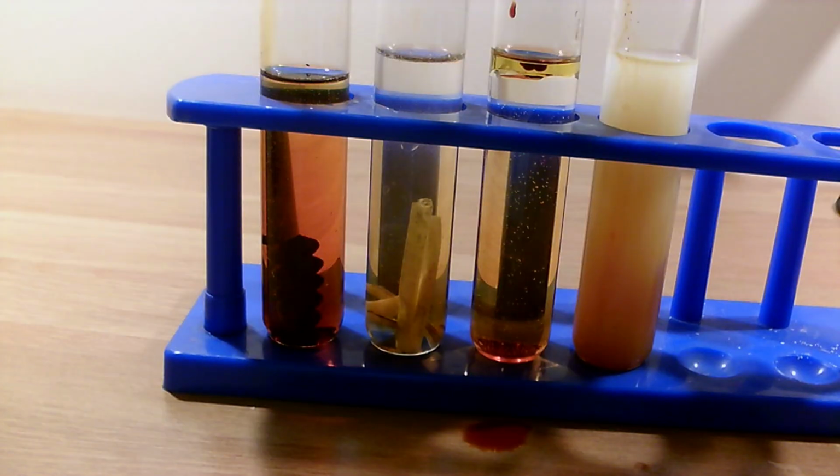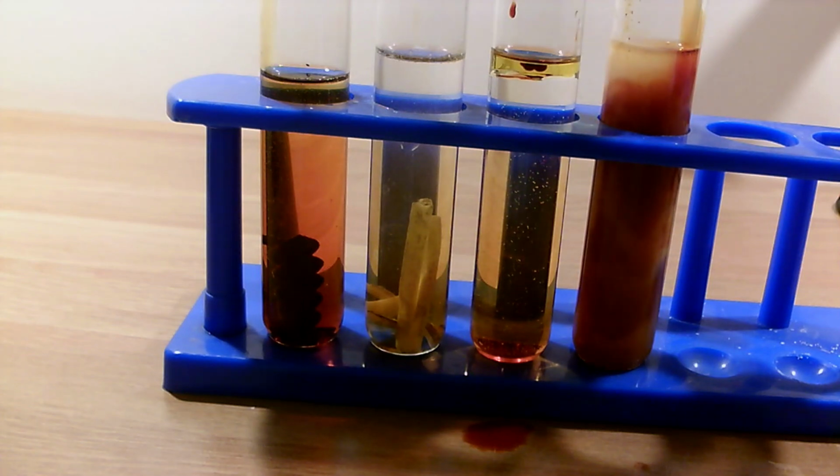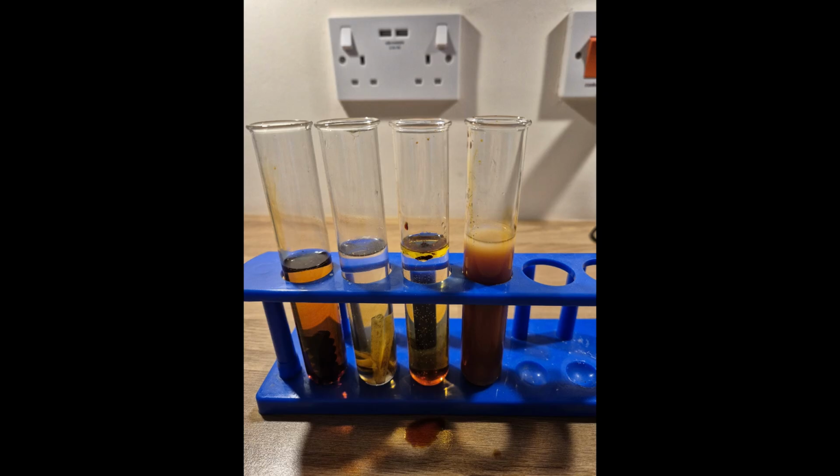The pasta in the first test tube has changed from orange to a blue-black colour, and that shows that the pasta contains starch. The cheese in the second test tube has stayed orange, which is the same colour as the iodine, because the cheese doesn't contain starch. The oil has also stayed orange and the milk has done that too. This shows that the only food that we have tested that contains starch is the pasta, because that's the only food that has changed colour when we added the iodine to it.